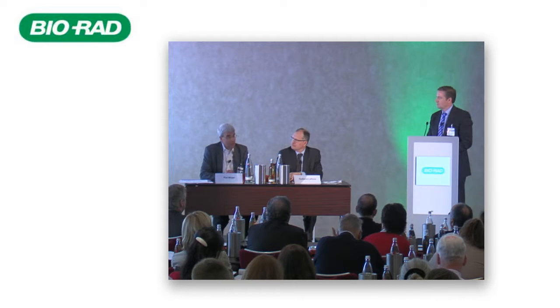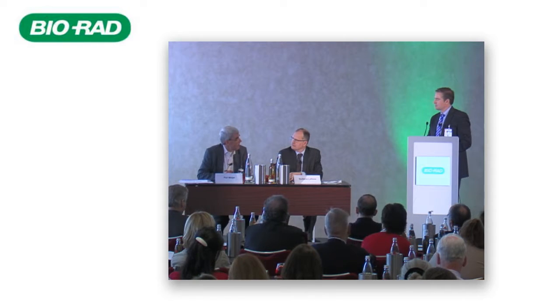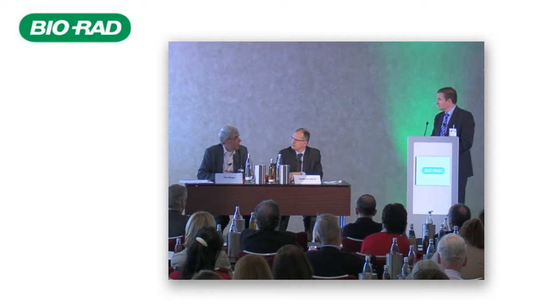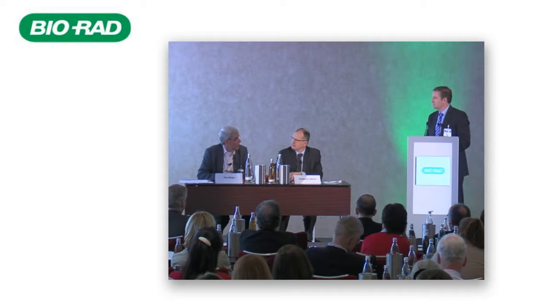Next to that, within the arena of EQA providers, we should think about why we have these differences. Are they only historically based, and is there a manner that we can also harmonize the manner in which we have designed our programs? That does not mean that I would say that all the EQA programs should be equal. That depends also a little bit on the focus of the program.